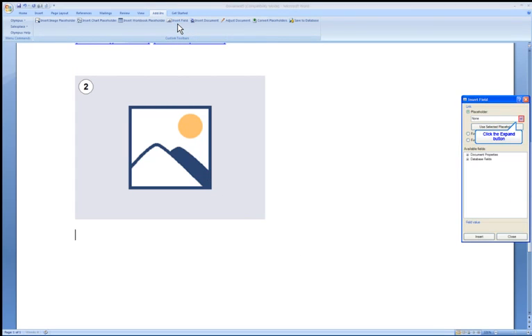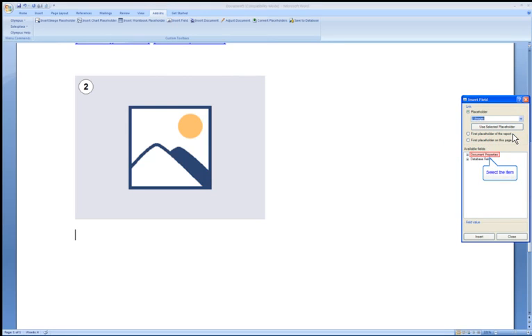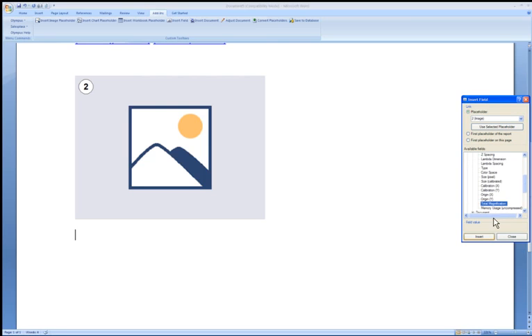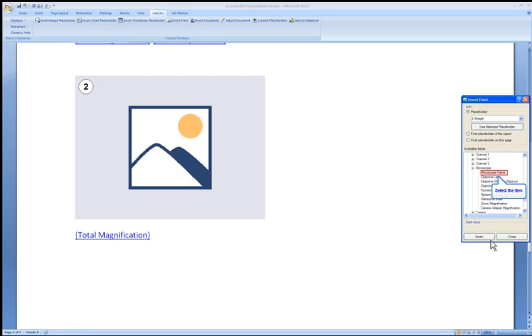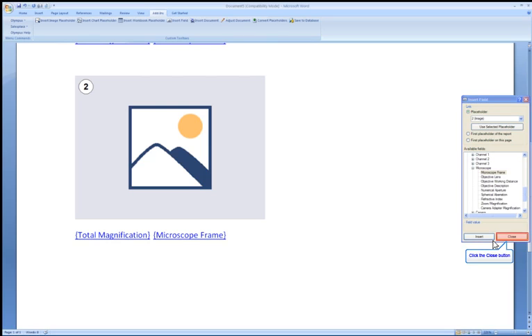Select the drop-down menu. Now select the second image placeholder to link to. Select total magnification. Click the Insert button. Let's also select Microscope Frame to be inserted. Click the Insert button again. The Insert Field tool window can be closed.